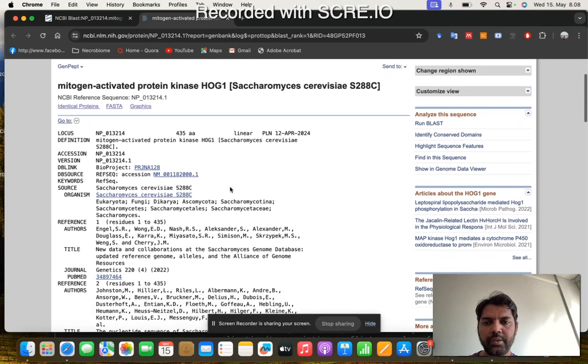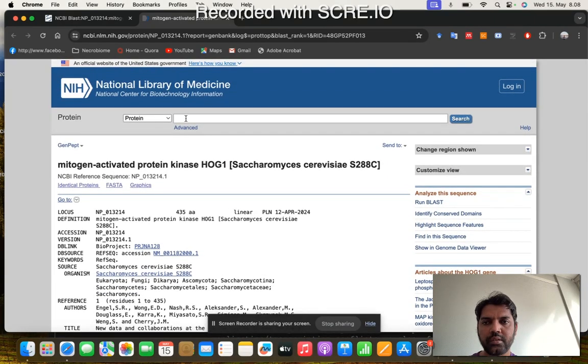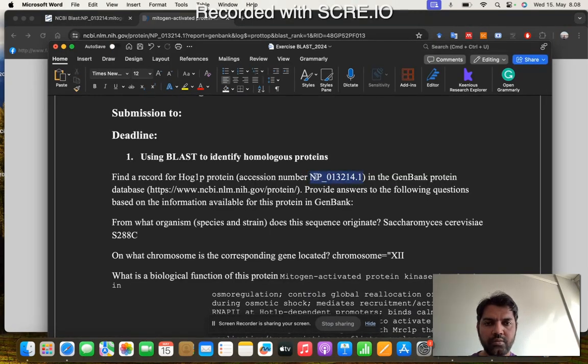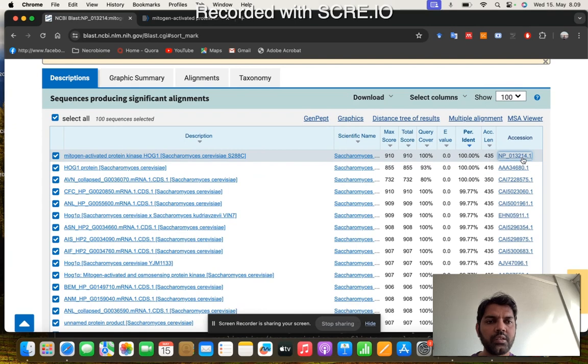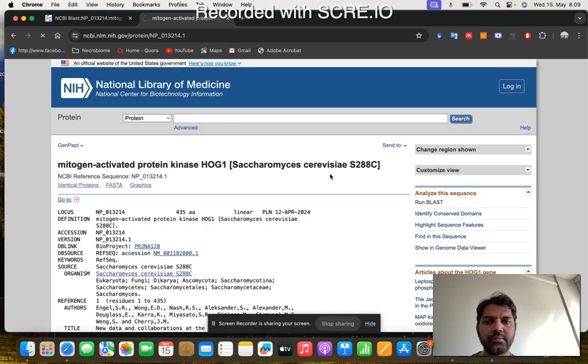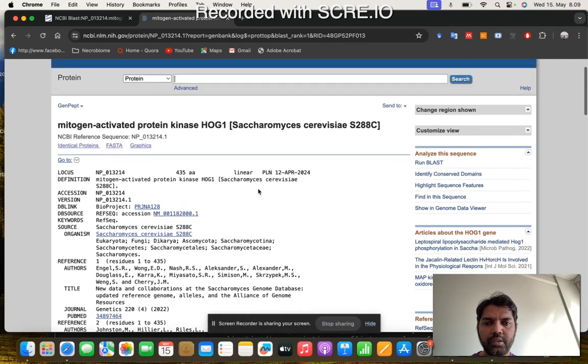So again, we are on the same page where we were at the start of this video, because before, I just put my number here. I can show you again to sum up. At the start of the video, I just put this accession number here and clicked search, and it came with the same page that I just reached by clicking here. So that is how you find the information of homologous proteins in BLAST.